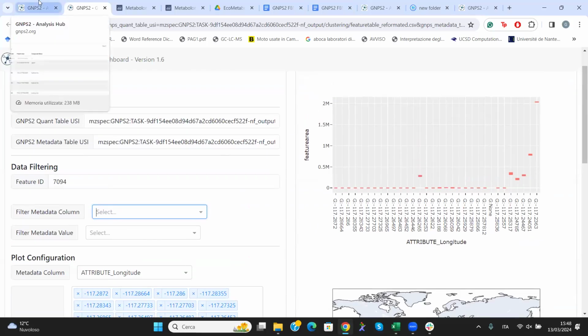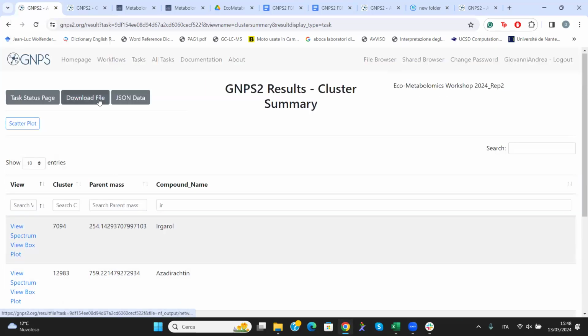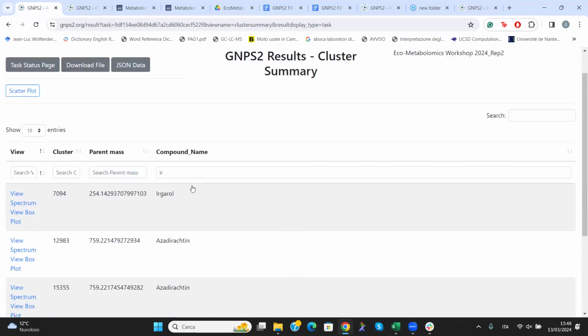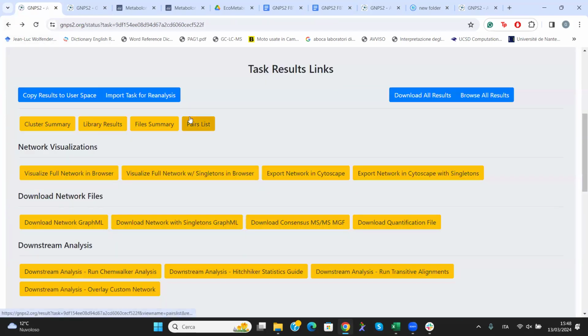So is everyone fine with that? Great. If you have questions, just stop me. And so we can go back to the previous page. Let me see. Okay, we can go to the main page, which is this one. Please, everyone, try to get to this page.